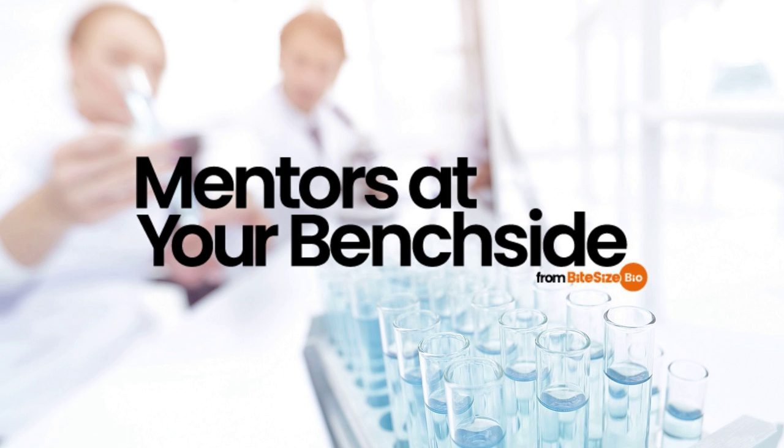What's wrong then with liquid nitrogen? Well, it's not that it isn't cold enough. At minus 196 degrees centigrade, it's a bit cooler than liquid ethane. In fact, liquid nitrogen is used to keep the liquid ethane cold. One problem lies with its heat capacity. Heat capacity is simply the amount of heat energy a material can absorb to produce a given change in temperature.